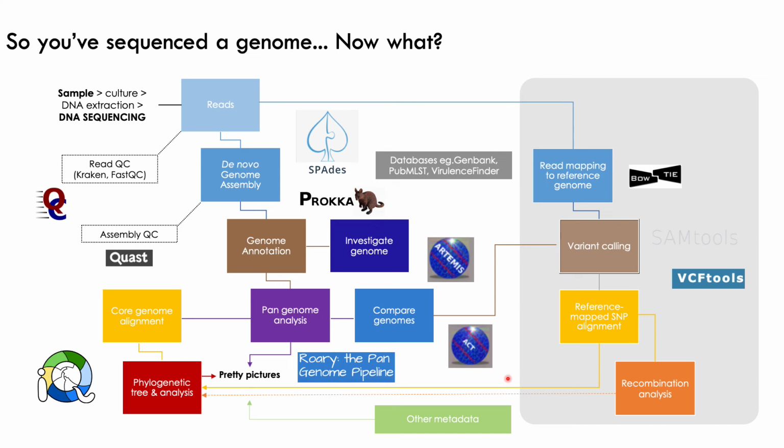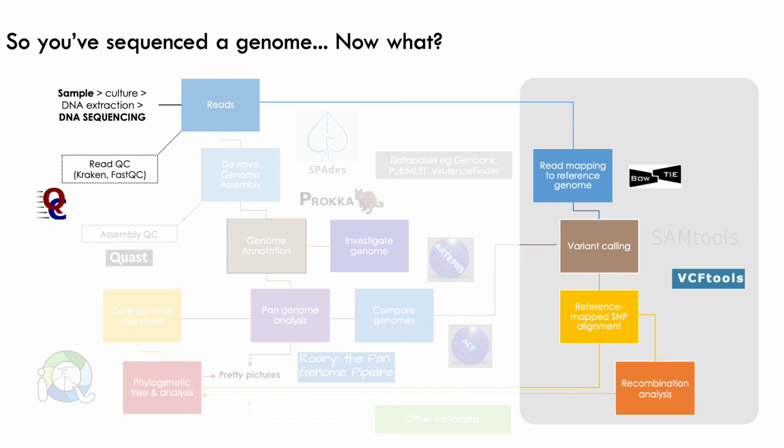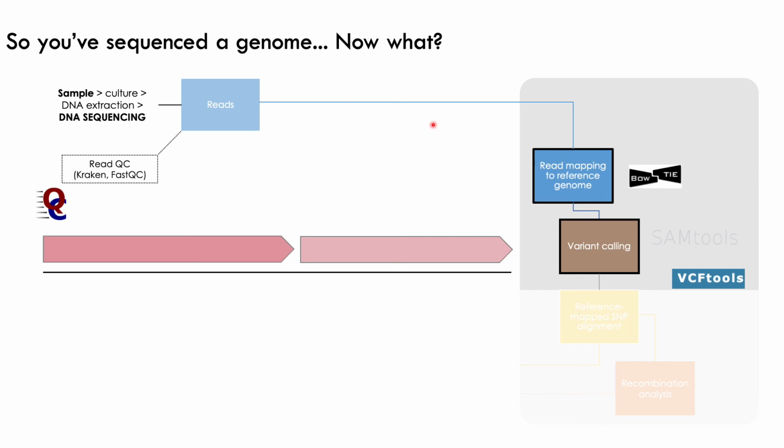And as I touched on earlier, using this pathway relies on some assumptions. The main one, of course, being that we need a reliable, high quality and highly similar reference genome to call variants against in our data set. So I'll talk about this pathway in a bit more detail. So for this example, we take our reference genome, which has 2 genes. It's even smaller than the ones before. And each gene has a sequence as shown here.